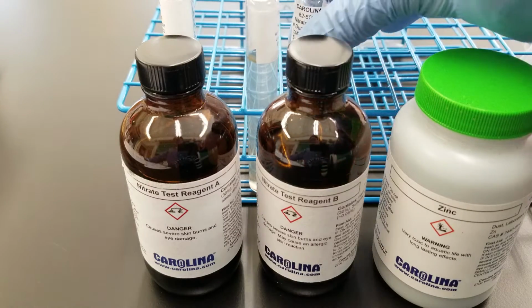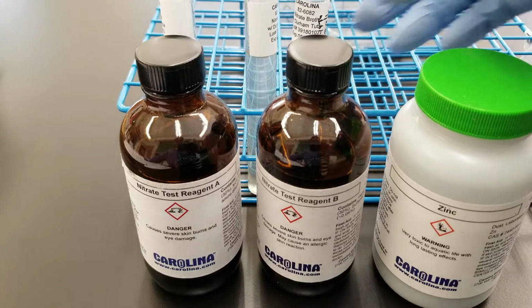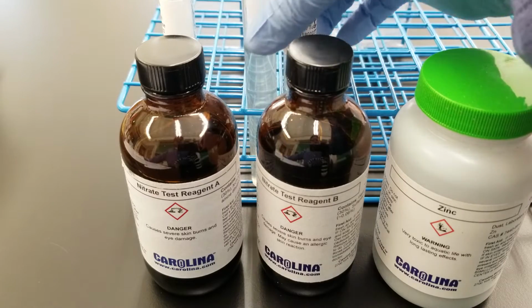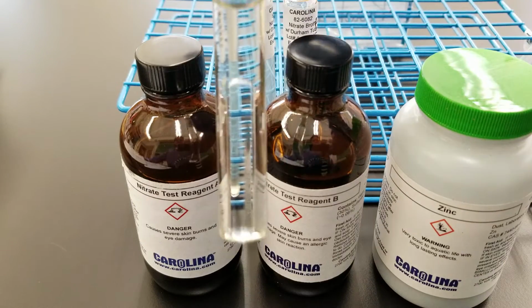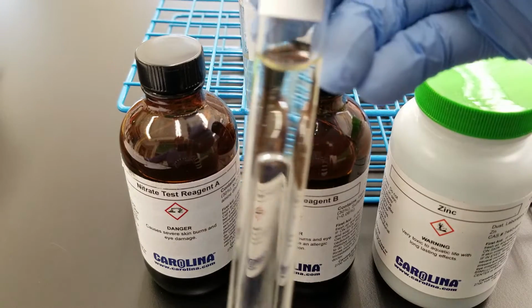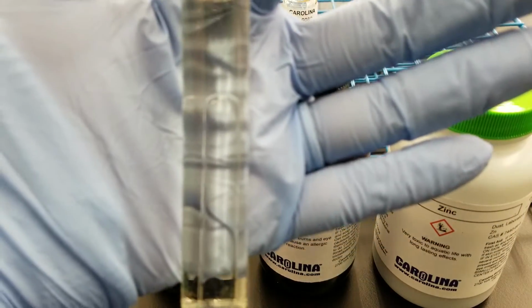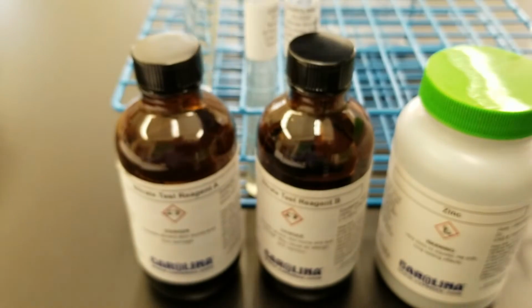So we are hoping that these are going to go right, and the Moraxella should be positive, the Neisseria should be negative, and obviously the uninoculated tube should be negative too. And still no gas production here in the Durham tube, the upside down tube. Come on and focus for me. Okay, so that's good. That's showing that that's still good.